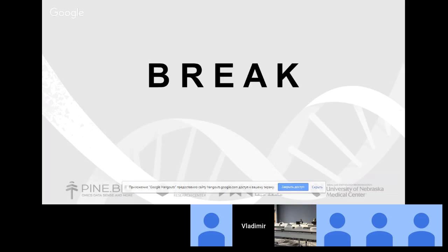But the alternative method, GAGE, also performs the same pathway or gene set enrichment analysis, just using a different and more complicated statistical model, and it is performed inside the same platform.